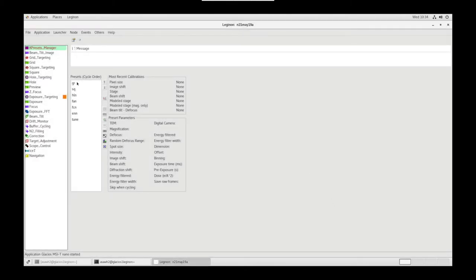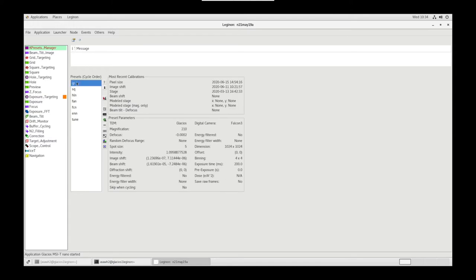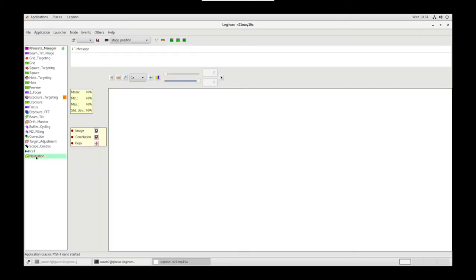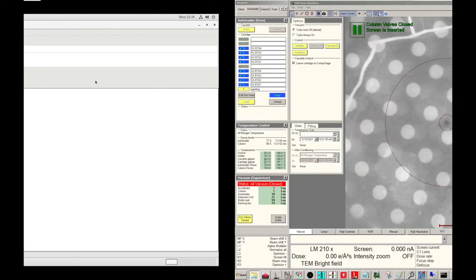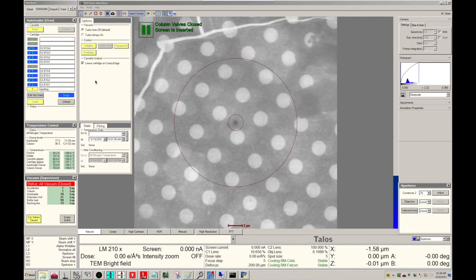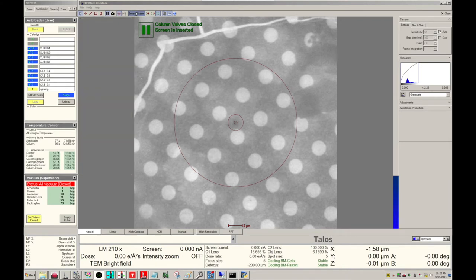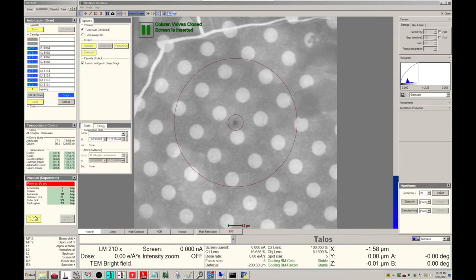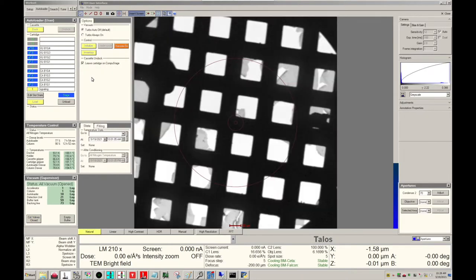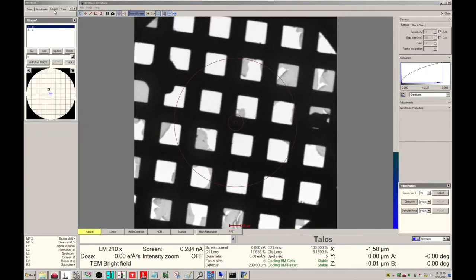Send the Grid Preset to Scope. Go into Navigation and obtain the image from there. Or you can click R1 to insert screen, or use this button up here. Open Column Valves. Now let's go to the Search tab and let's send our location for Carbon. Click Go.